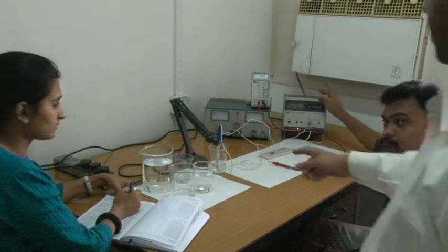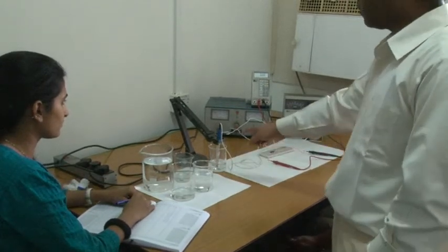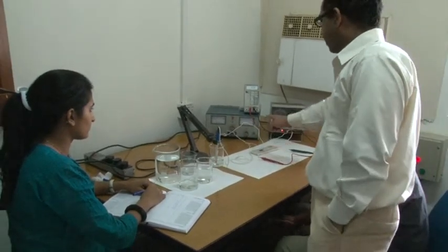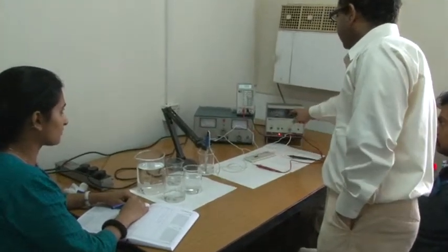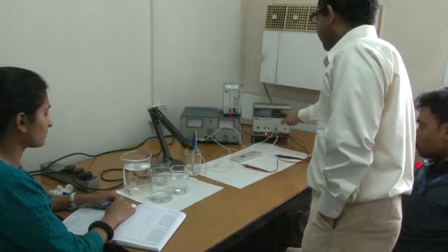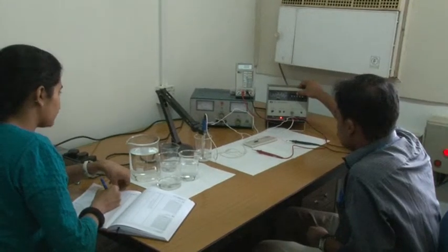Now we move to the ICFET characterization setup. We have 3 pH solutions: pH 4, pH 7, and pH 10. We shall be dipping our ICFET device with reference electrode into these pH solutions one by one. Initially we apply VDS of 5V through this power supply to the MOSFET. The VGS will be applied through this power supply via the reference electrode, and we will observe the drain current on this multimeter by applying the reference voltage.